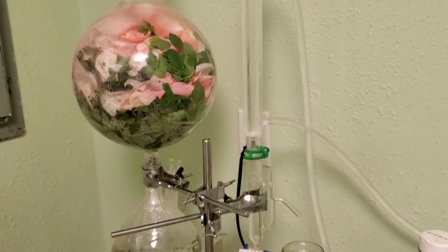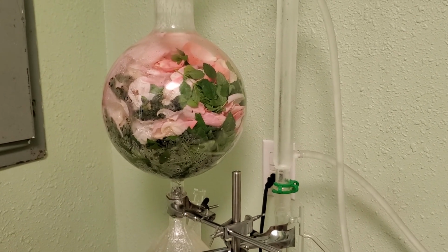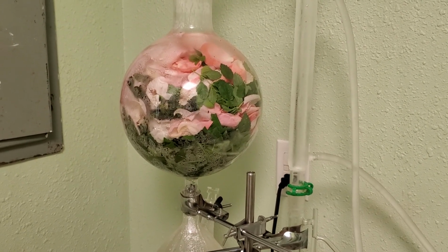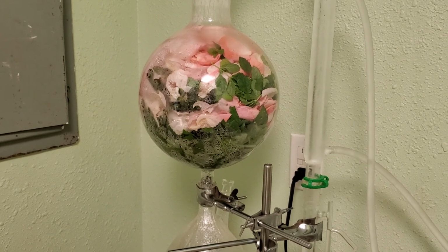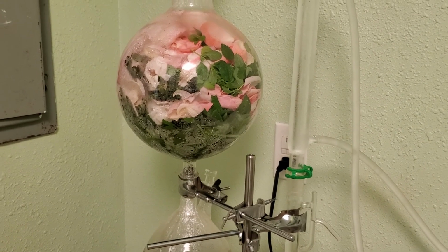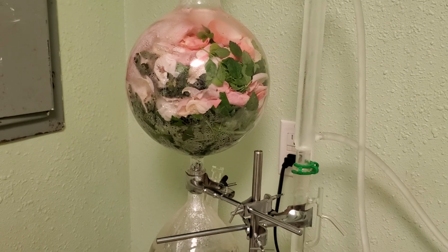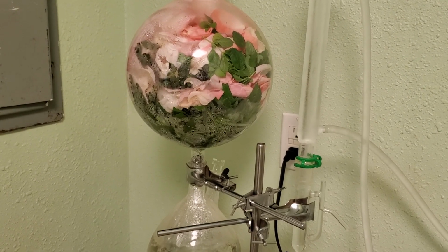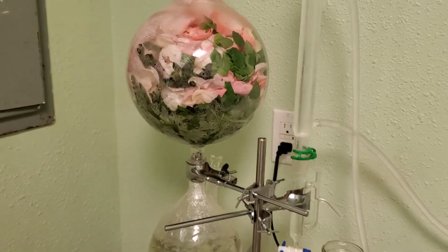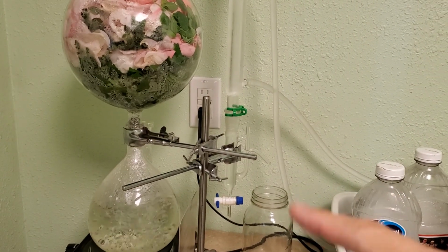So even though this looks like a big, and I believe this is a 3 or 5 gallon flask, even though this looks like a lot of plant material, and it certainly is, it's not going to produce even a quarter of an ounce or an eighth of an ounce of essential oil. It's not going to produce very much at all. And some of that's a function of the herbs that are in there. Lemon balm, for example, takes acres of herb to be able to produce even like a half an ounce of essential oil. So we're distilling here primarily just to get that hydrosol.